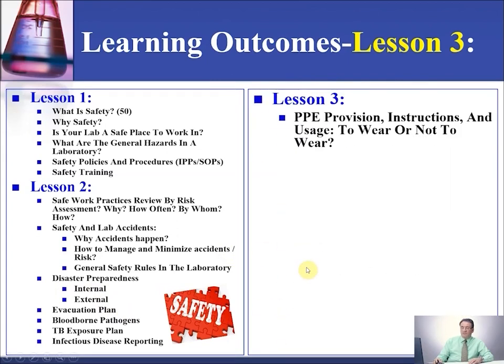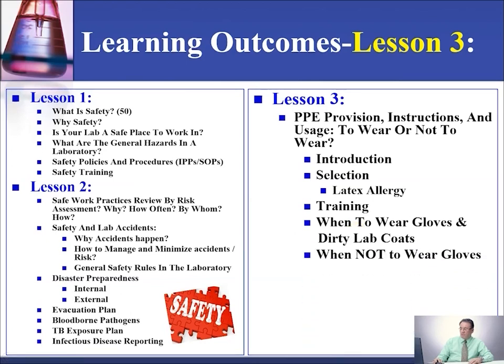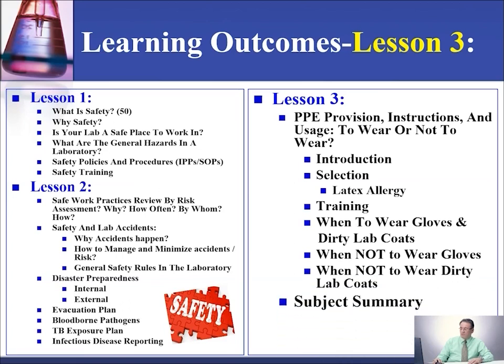In this lesson, lesson 3, we'll cover also a very important topic, PPE provision, instructions, and usage, to wear or not to wear. And we'll have a brief introduction for you. We'll talk about the selection, and under the selection, we'll talk about latex allergy, talk about training for the PPEs, when to wear gloves and dirty lab coats, when not to wear gloves, when not to wear dirty lab coats, and a subject summary. So let's start with lesson 3.